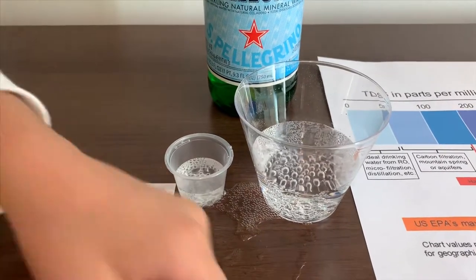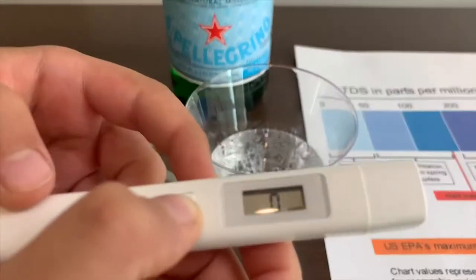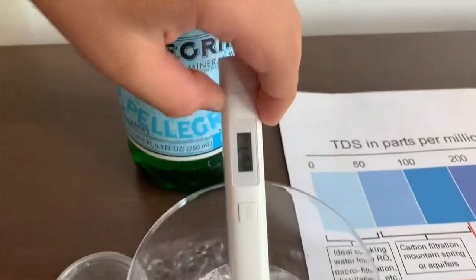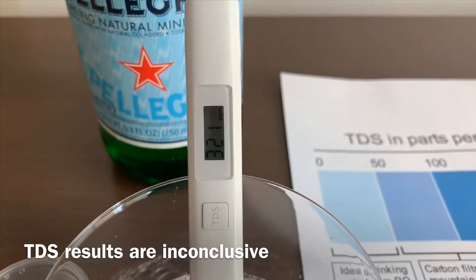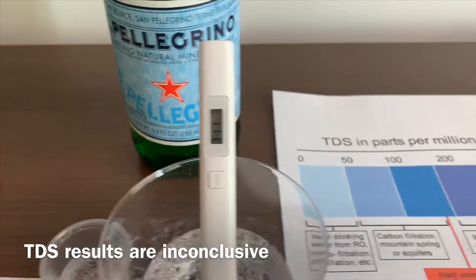First, we're going to test the TDS. Turn on the TDS tester. Make sure it says 0 and put it in. It reads around 490.